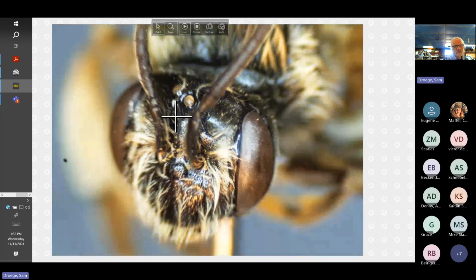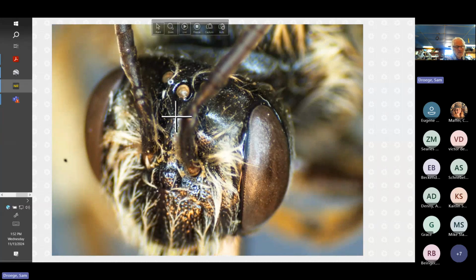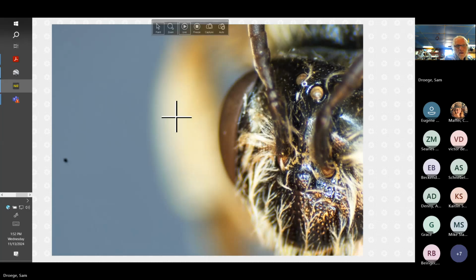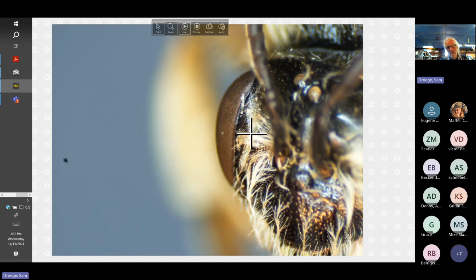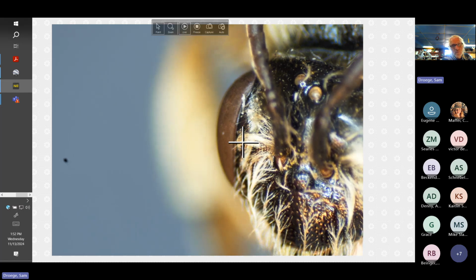That's where you start second guessing things. If we look, as was mentioned, at the edge of the eye to the bend in the facial fovea, here's a facial fovea, right? So it pulls away. So this distance here is much greater than one width of the facial fovea narrow part here. So in other words, it's pulled quite a distance away. It's not running close like some do.